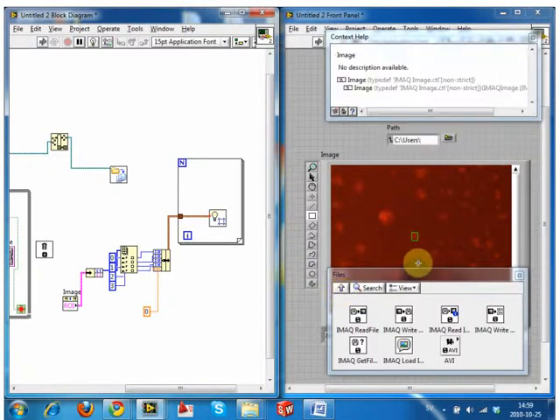It would be more ideal if you outputted gray images for each channel on the confocal, but people tend not to like doing that. This one was done with a color camera, so that's fine. But we can separate out each of the channels individually and then apply it to just one channel.